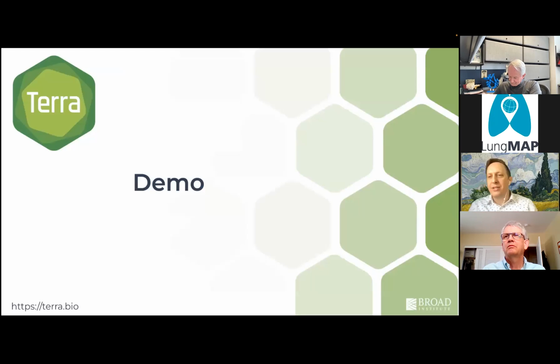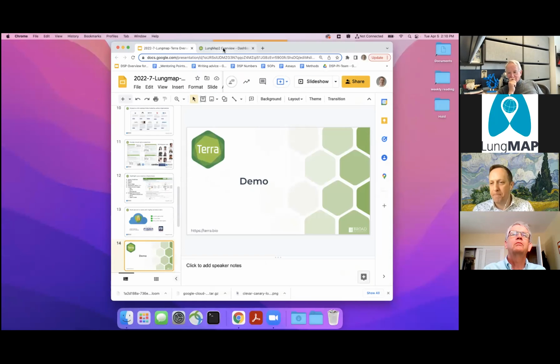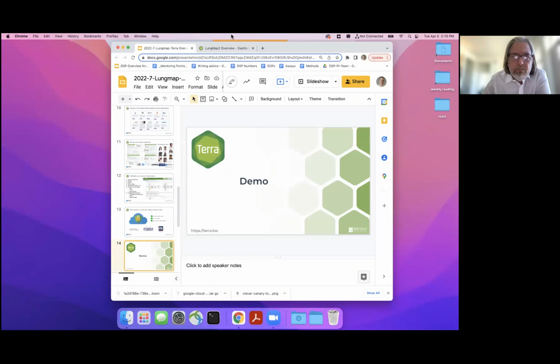So at this point, unless there are major questions, I'd love to jump into our demo to keep us on time. So far we're on time, which is excellent, team. Let's talk a little bit about Terra as a demo, because it's better to look at it actively. All right.